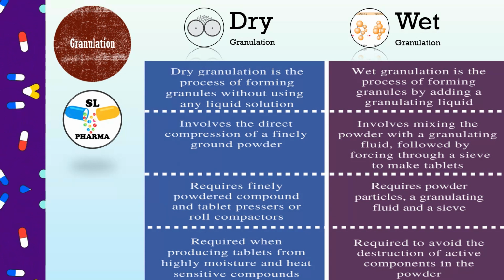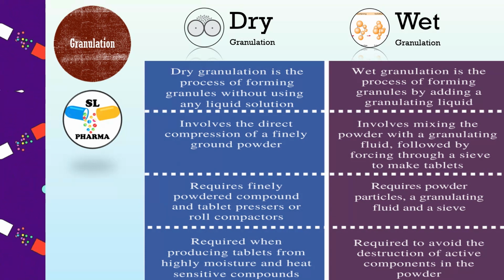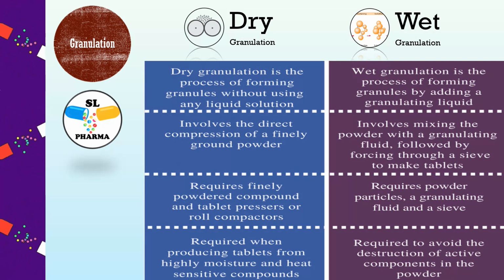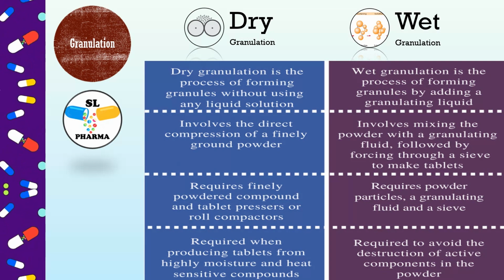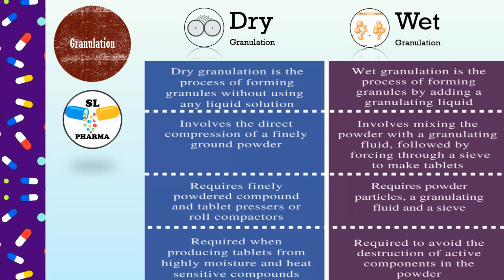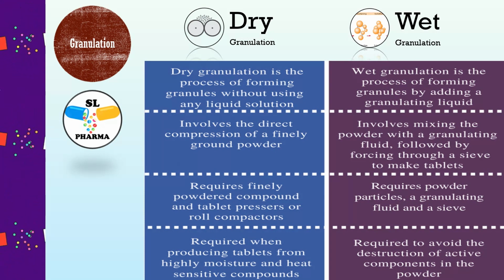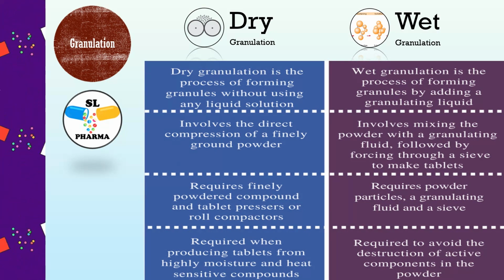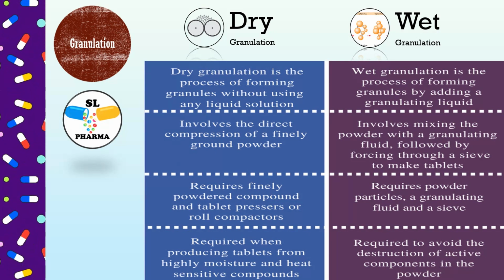The second type uses a fluid bed processor in which particles are placed and vigorously dispersed and suspended while liquid excipient is sprayed onto the particles and dried. Depending on molecule sensitivity, aqueous, water, or non-aqueous, organic, solvents are used for the granulation process. Aqueous processes are considered safer and cost-effective.